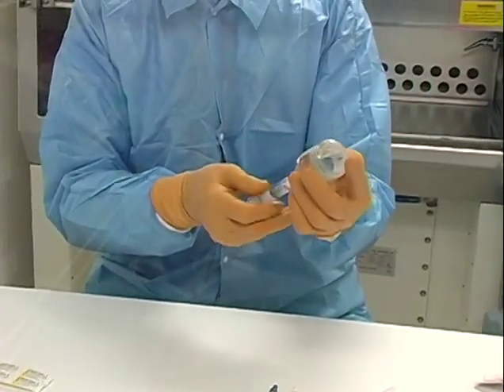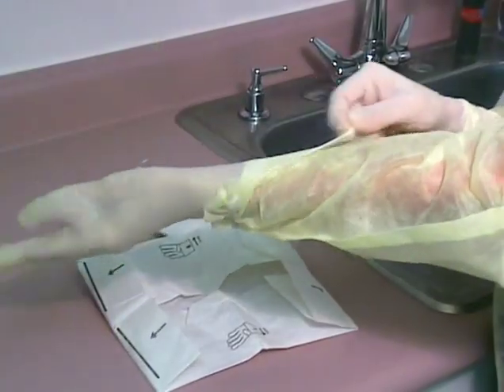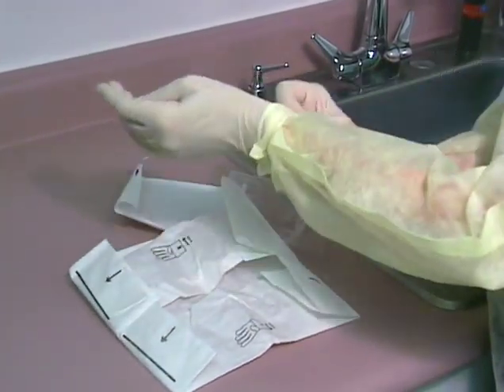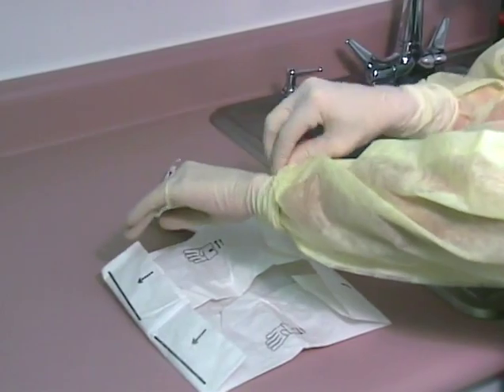Are gloves necessary? Yes. There are three arguments used by those individuals who do not want to use gloves. First is latex allergy. Second is reduced finger dexterity and tactile feel, which can lead to lower productivity. And three, "I am careful and never touch aseptic surfaces." All of these reasons are flawed.